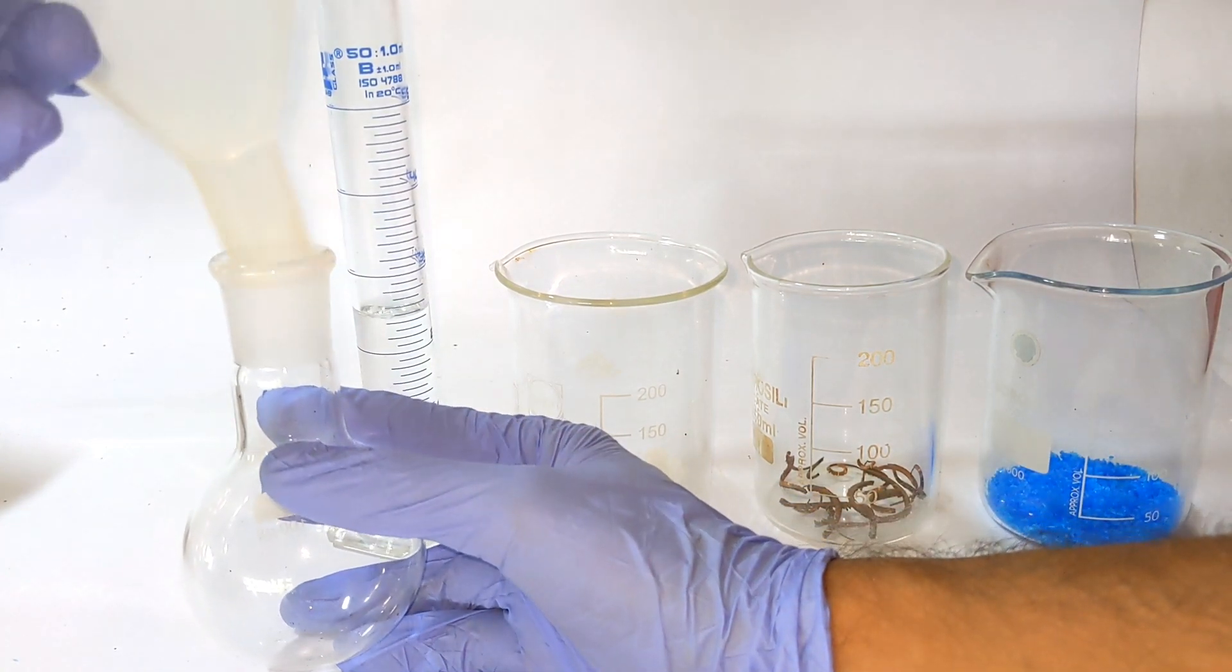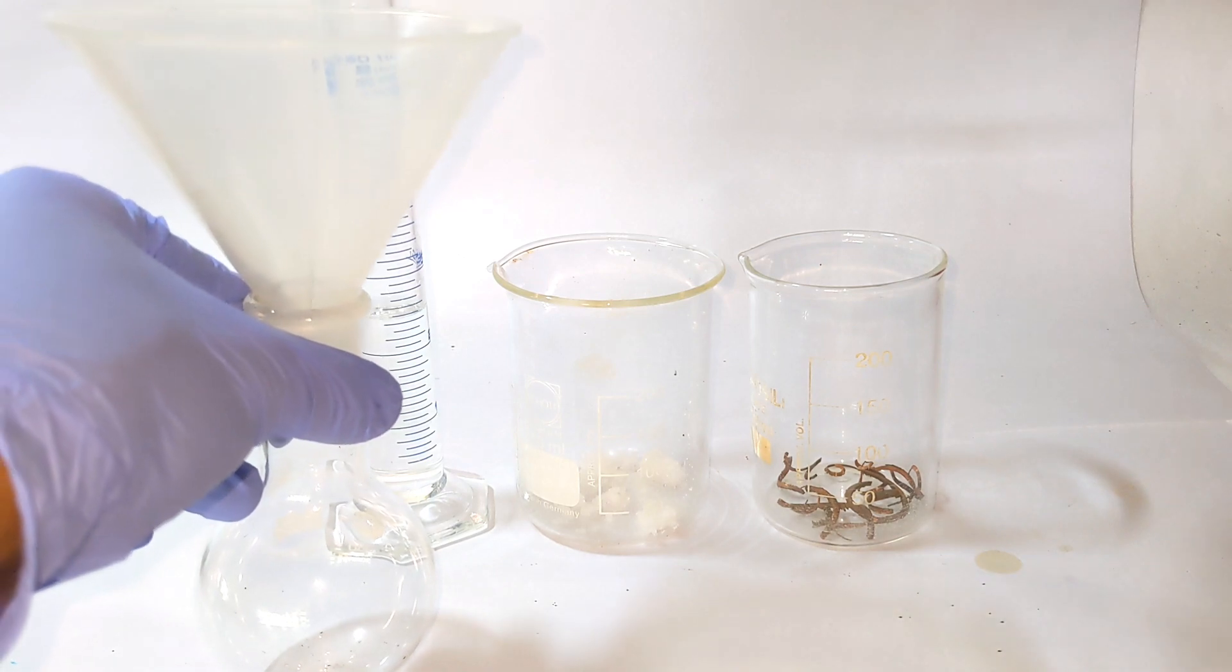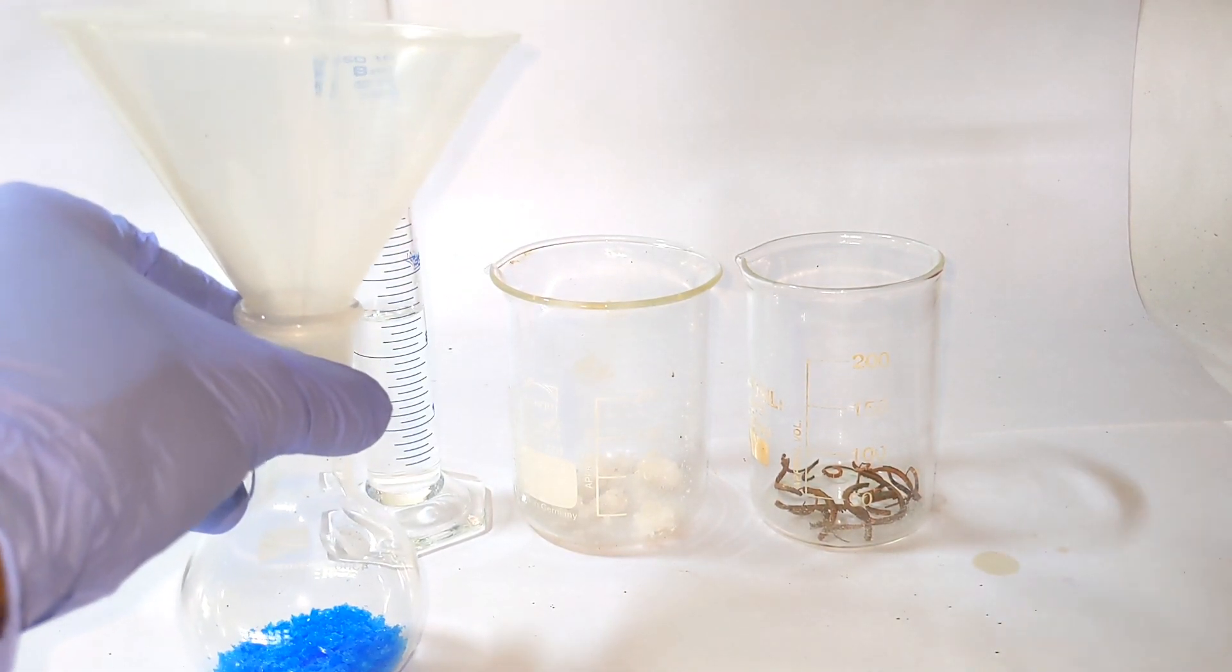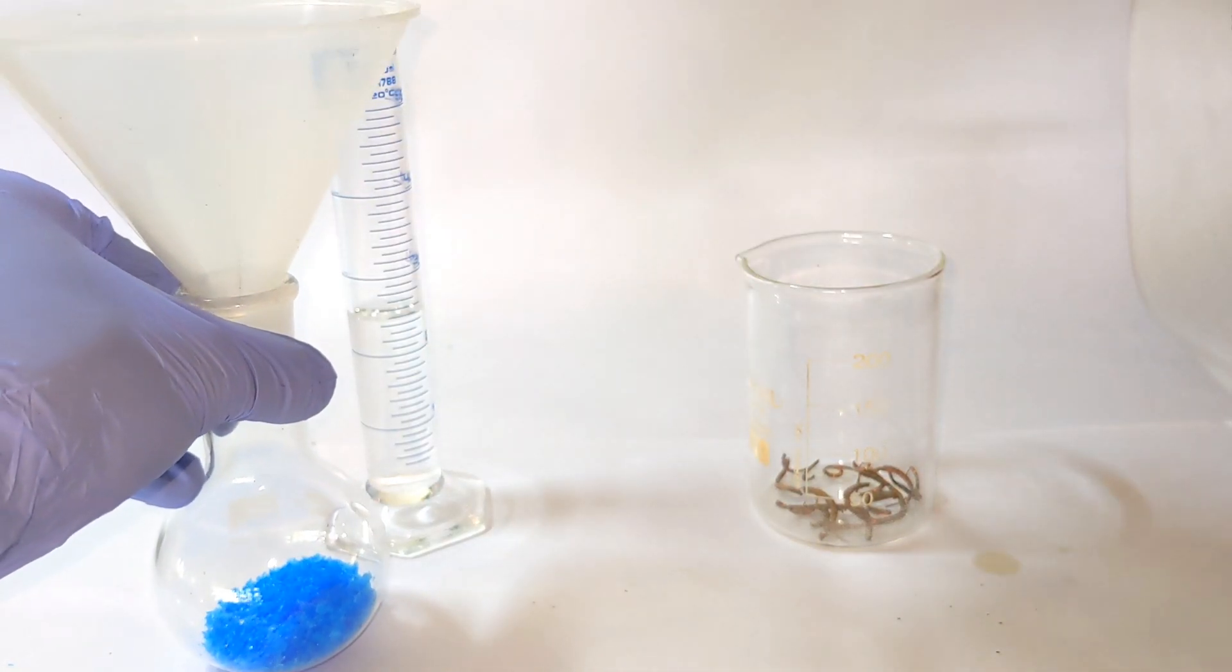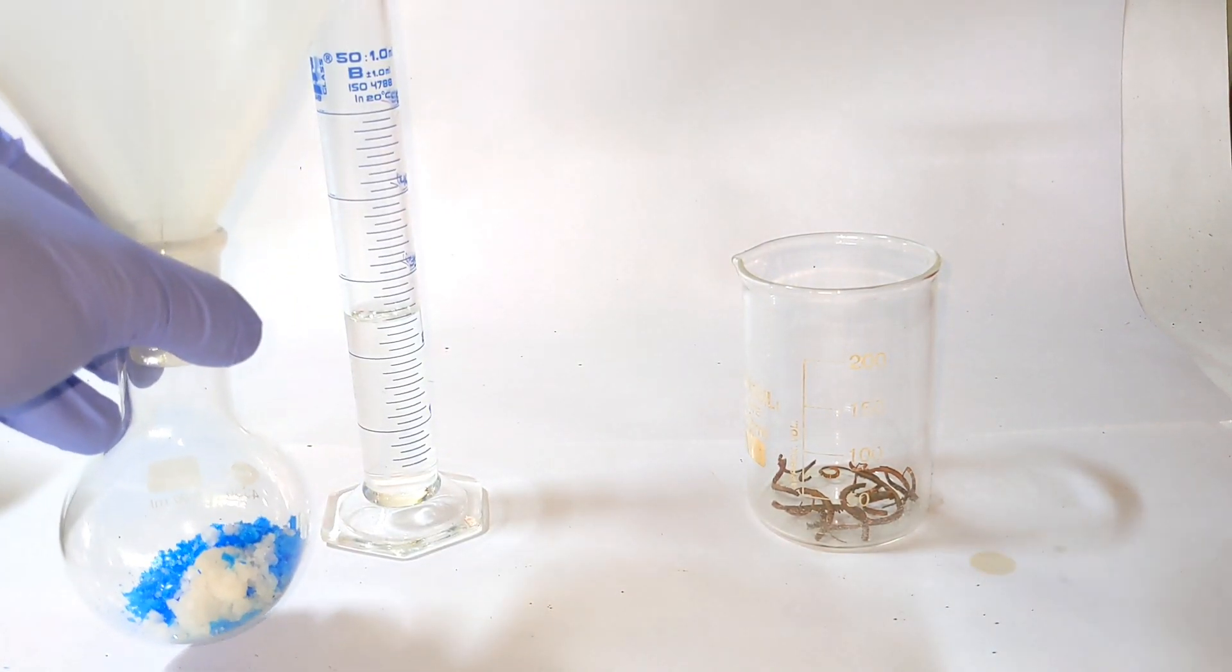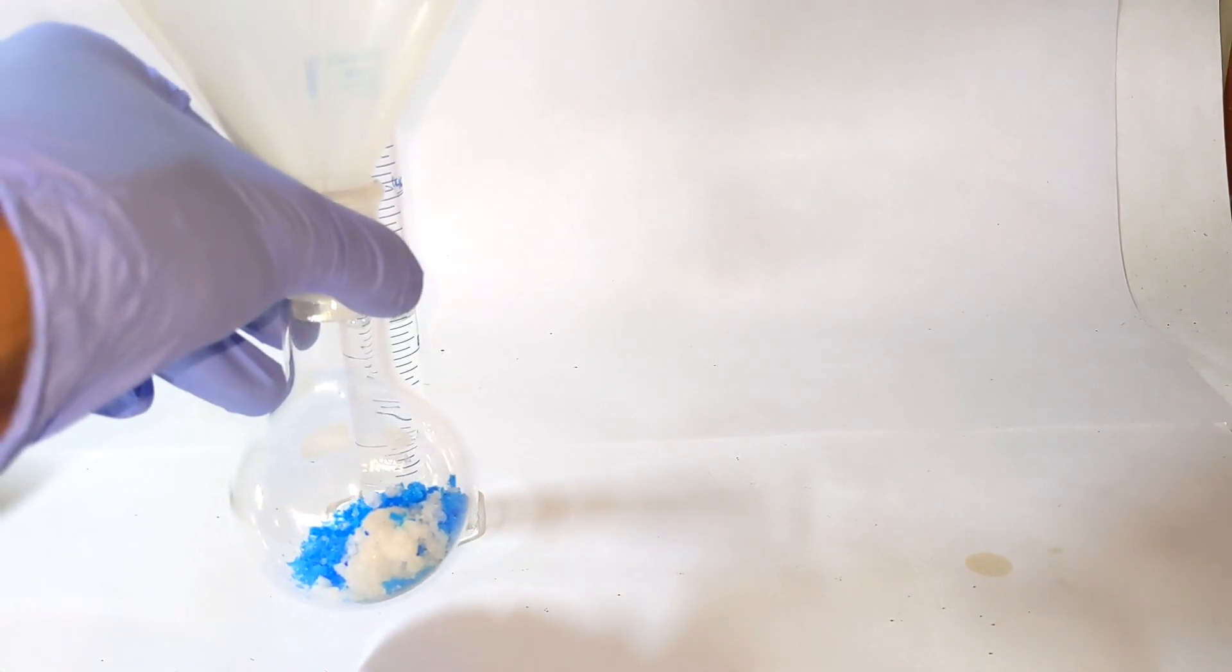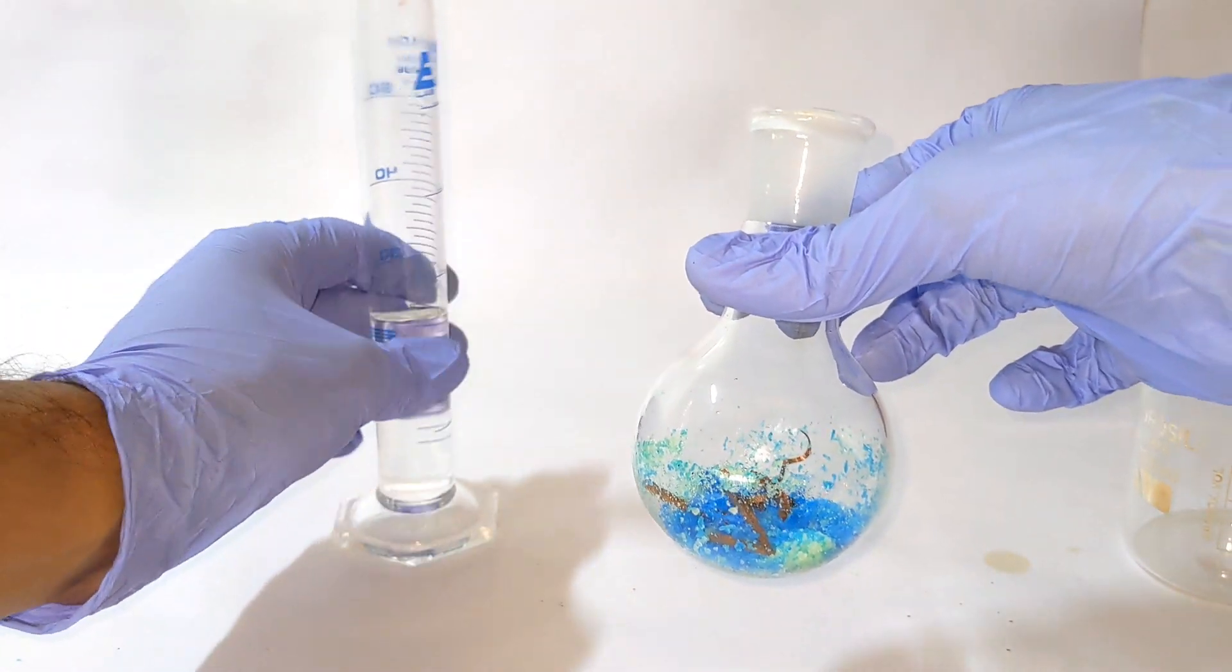Next, we need to make cuprous chloride or copper(I) chloride. For that, take a 100 ml round bottom flask. A powder funnel was placed on top. 10 grams of copper sulfate pentahydrate, 5 grams of sodium chloride, and then 10 grams of copper metal turnings were added to it. Copper turnings got stuck in the powder funnel as I had not cut them into tiny pieces.